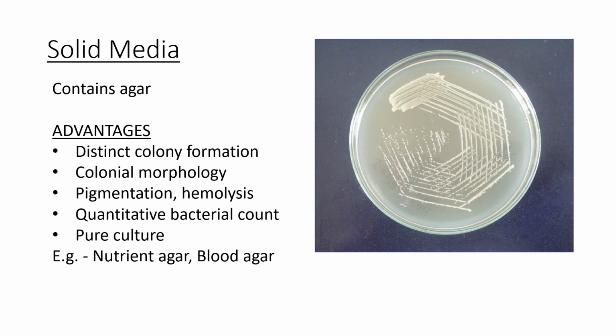Now we are going to discuss solid media. तो solid media itself means कि इसमें agar है. Advantages इसके ये होते हैं कि we can distinctly see the colony formation, colony morphology. We can see the pigmentation, hemolysis if it is present, quantitative bacterial count, and we can easily isolate or we can detect if there is a pure culture or a mixed growth. For example, solid media are nutrient agar, blood agar. All these are the examples of solid media.